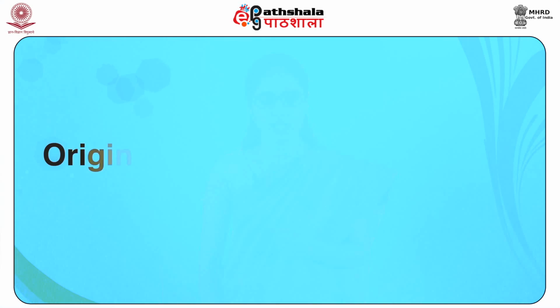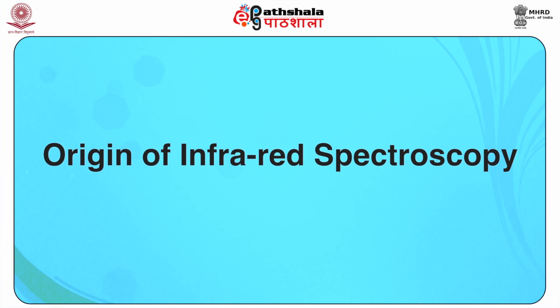Now, students, after having studied in detail the various regions of infrared spectroscopy, let us now study the origin of IR spectroscopy. IR spectroscopy gives information about molecular vibrations, or more precisely on transitions between vibrational and rotational energy levels. Since the absorption of infrared radiation leads to transitions between vibrational and rotational levels, as I have already told you, it is also known as vibrational rotational spectroscopy.